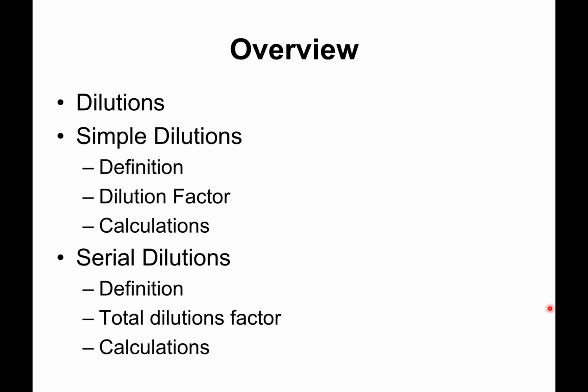And then we'll talk about serial dilution. A second type, this is a series, so several dilutions, more than one after the other. We'll talk about their definitions, how you calculate the total dilution factor and the final concentration. And we go through some example calculations as well.